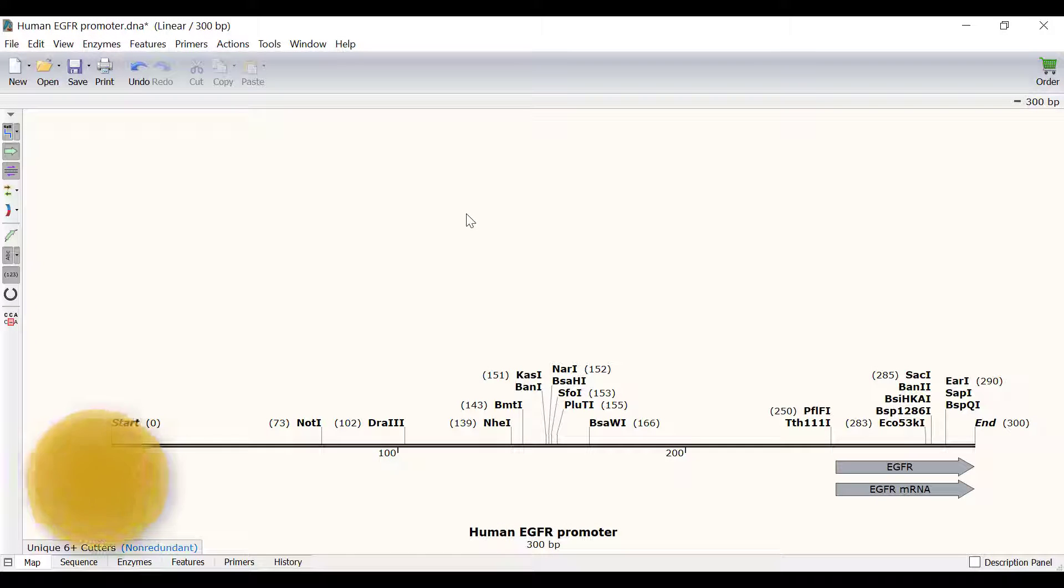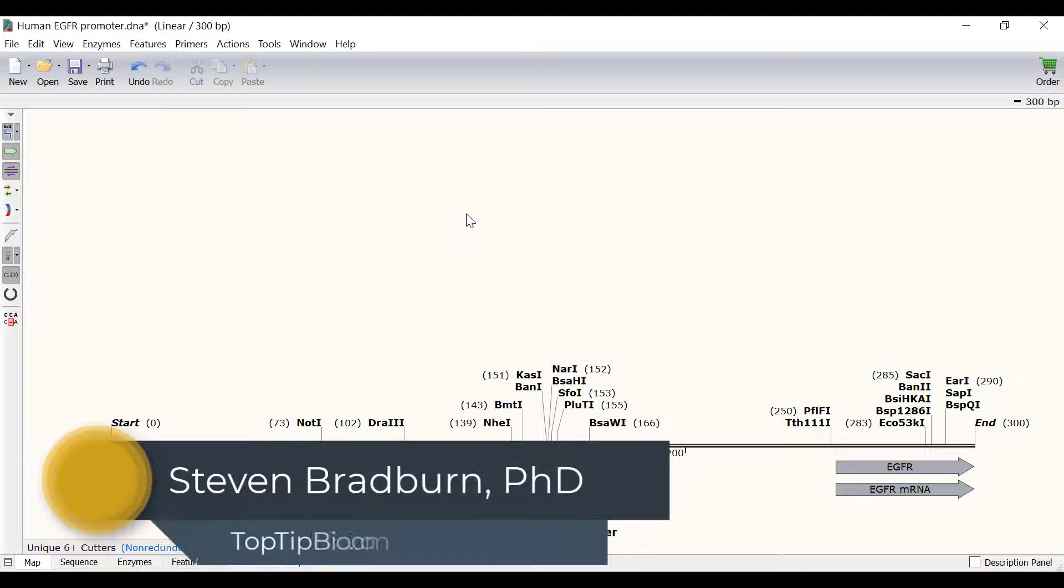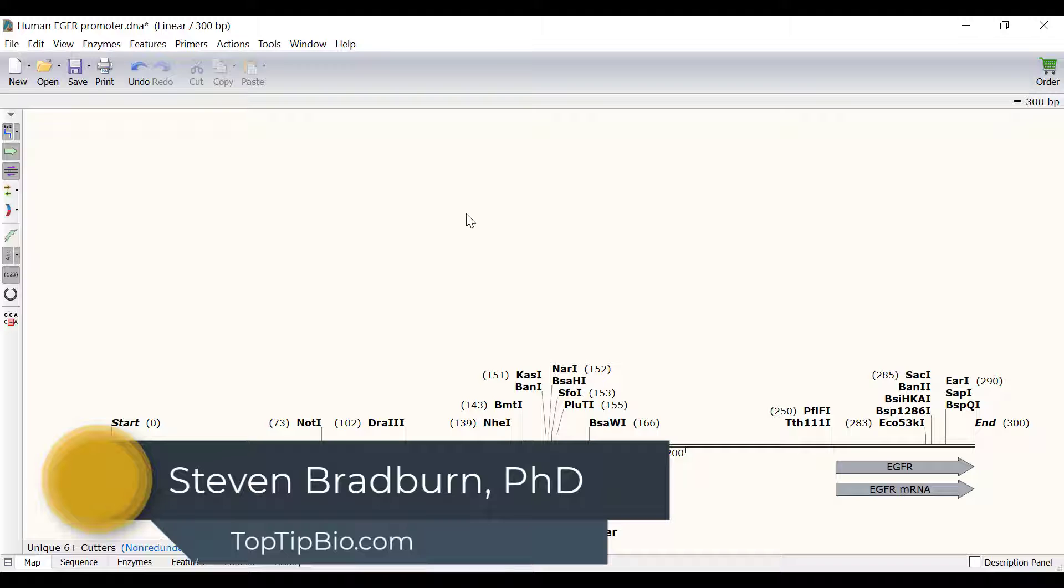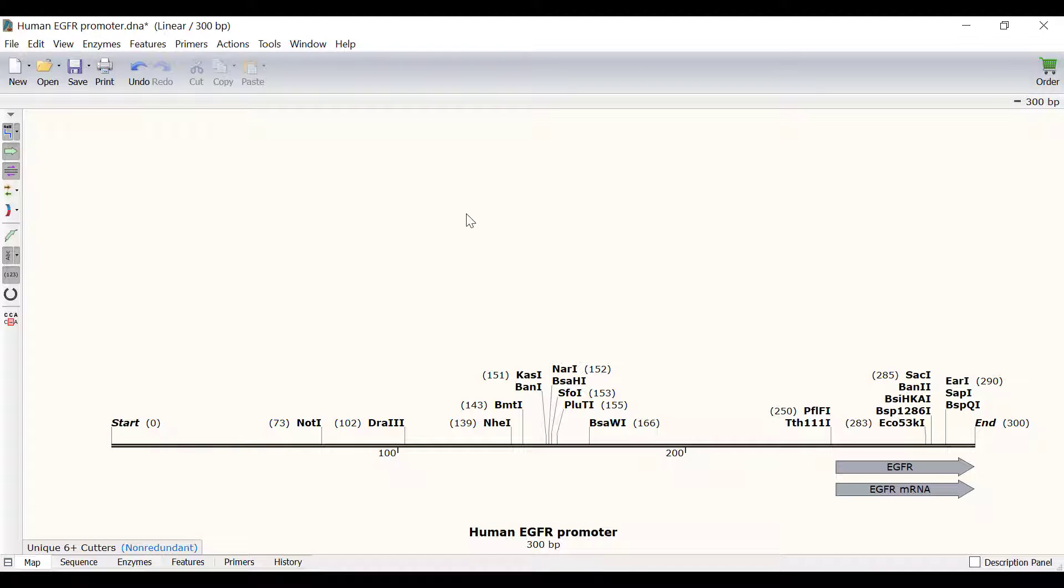In this video I will show you how you can use SnapGene to create primers and simulate a PCR reaction. In this file I have a sequence for the human EGFR promoter region.